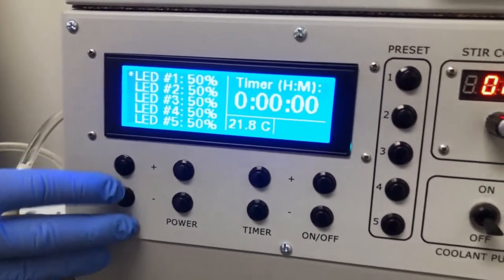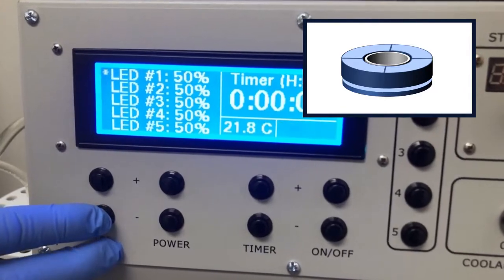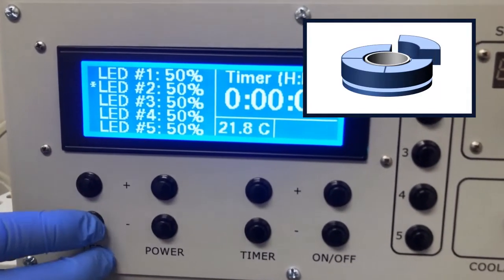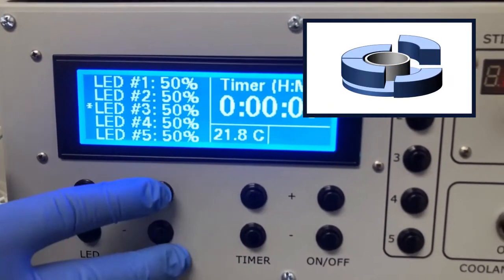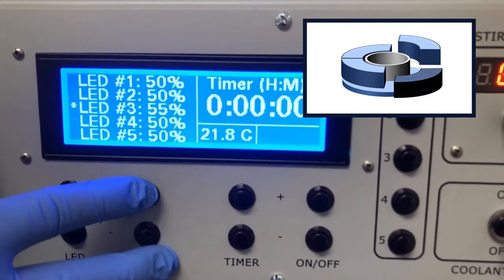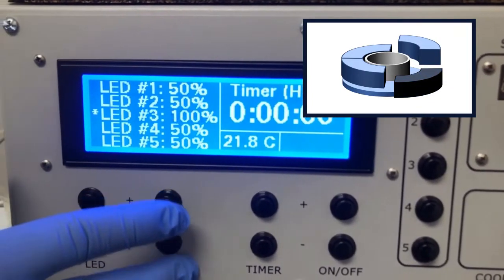As we navigate from the first module to the second and then to the third module, you can also see how the power buttons enable us to adjust the intensity of a specific module.